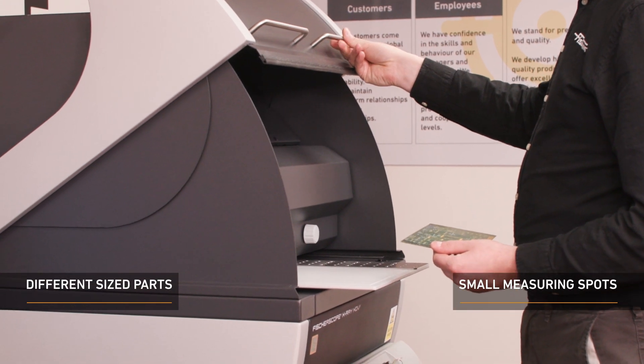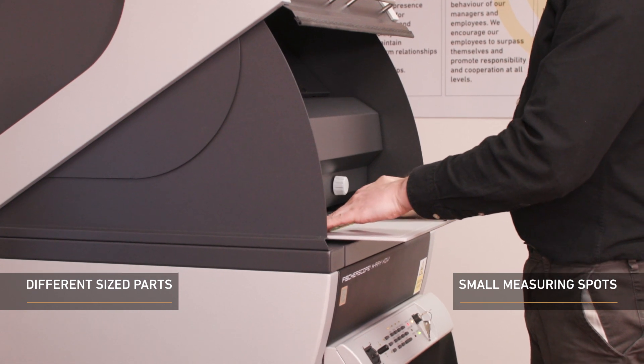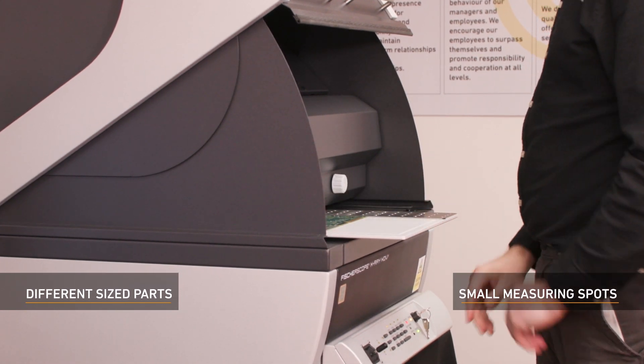With the FischerScope X-Ray XDV-SDD, the measuring diameter possible can be as small as 0.1 mm, making the robust instrument perfect for measuring small areas.